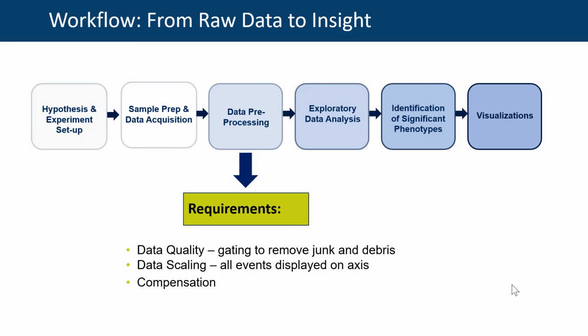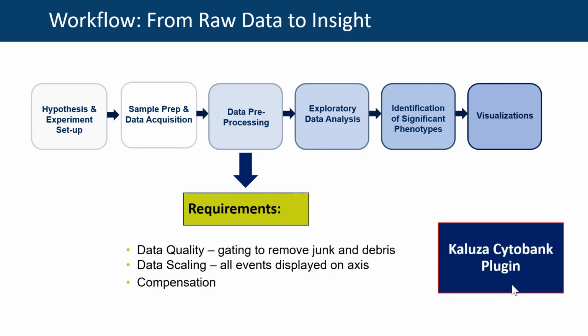All of this can be done within the Cytobank platform on the cloud if we would like to go that way. But Beckman Coulter actually just released a plugin for Kaluza that allows us to do all of this data pre-processing locally in Kaluza and then upload the pre-processed data files to the cloud to do all of our visualizations within the cloud. So we have the flexibility here to make a decision if we want to do everything within Cytobank or if we would like to use Kaluza as part of the process.